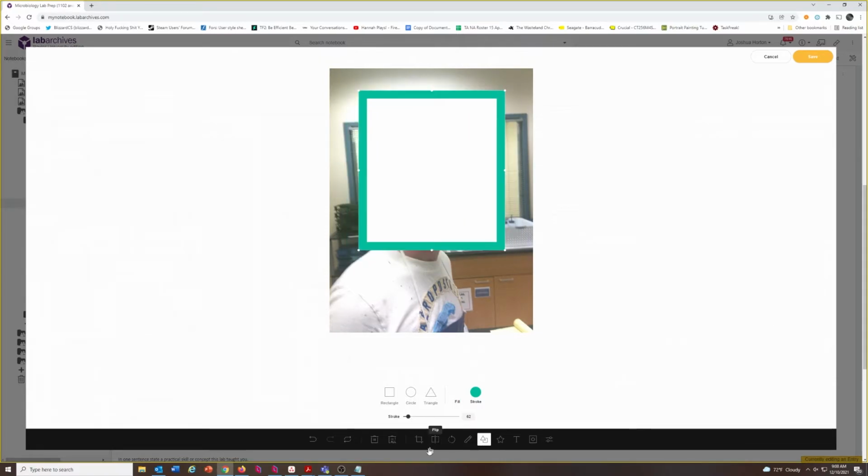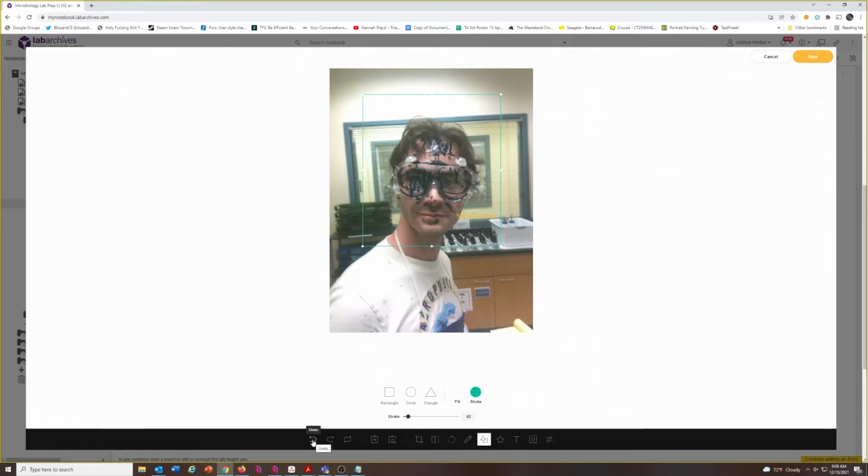These are all helpful. If you do something that you don't want to do, sometimes it gets a little hard to undo this. For example, there's not really a good null color here. There's no real null option here to get rid of that fill. But if you just hit back a couple times, it will get rid of it. Okay. Aside from this, you can enter in different icons, arrows, which are very handy, text, which I showed you guys before. You can put masks and all that other stuff in.